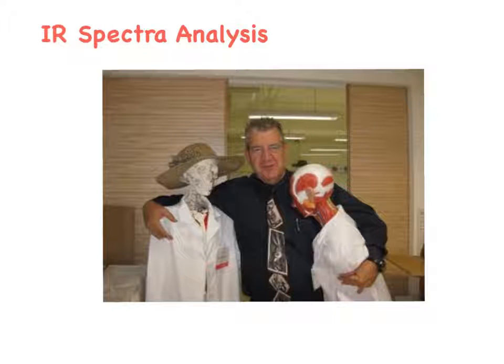Another really good analysis technique that we don't actually use in class but can be used in larger laboratories is infrared spectra analysis. And it's another thing that we can be tested on in the exam, so let's have a quick look at it.